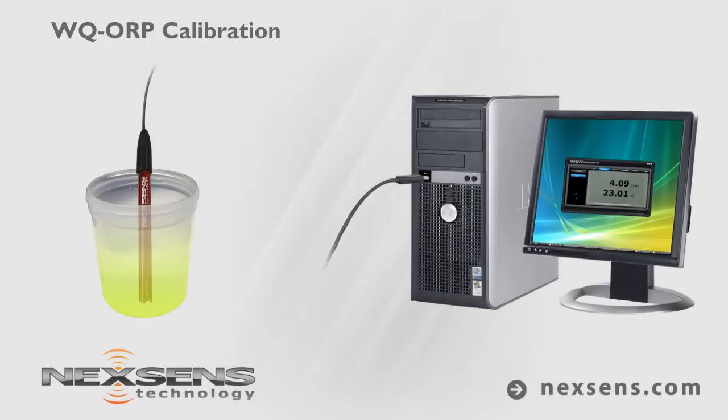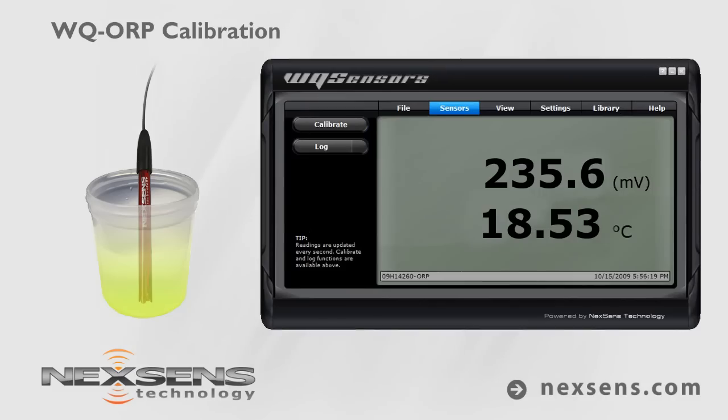With the sensor connected to your computer and the software running, immerse the probe in the ORP standard. A Zobel solution is the most common. Allow the reading to stabilize and press the calibrate button.